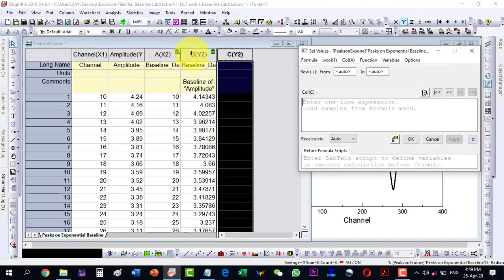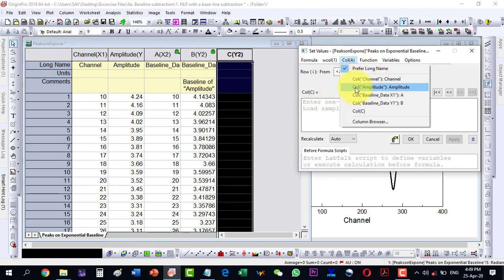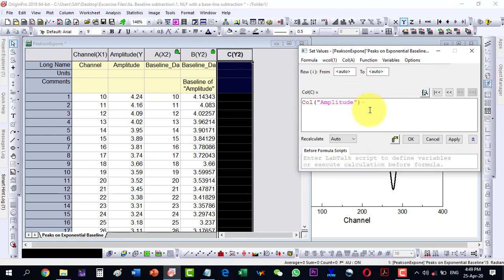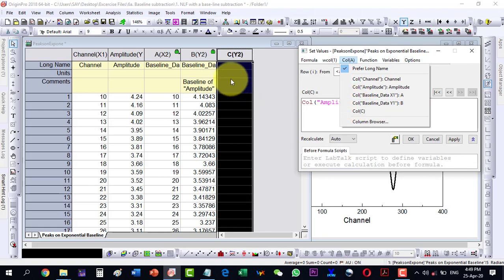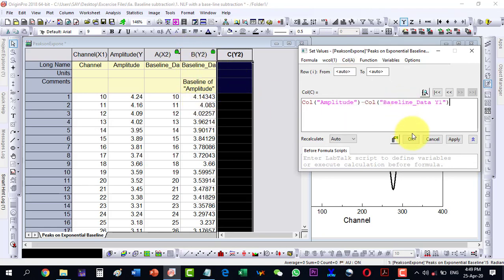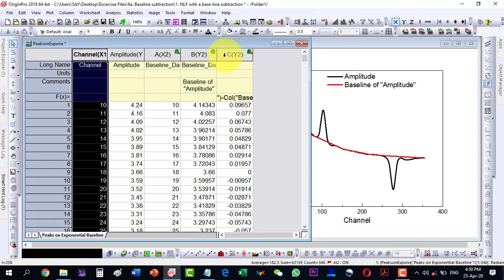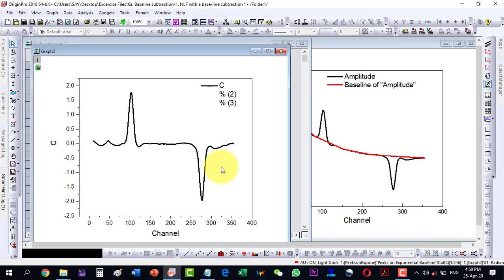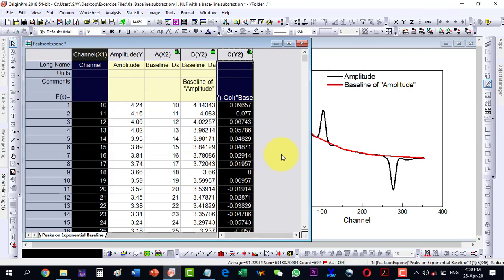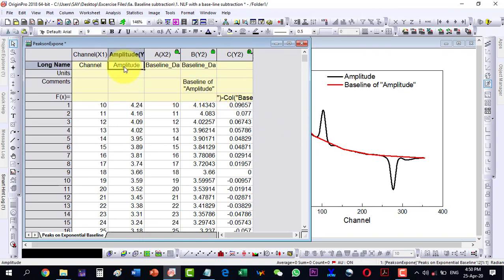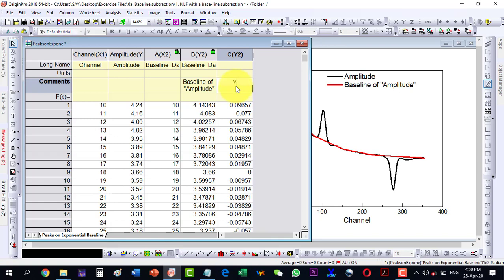I need to generate another column where I subtract the baseline column from the amplitude column. Going to Column settings, I select the amplitude column minus the baseline column (column B), click OK, and it generates the corrected values. This new column is now the baseline-corrected amplitude, which I label accordingly.